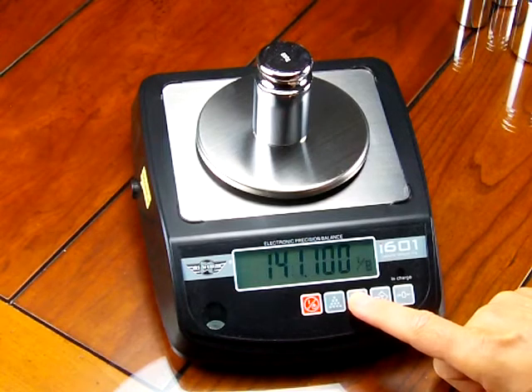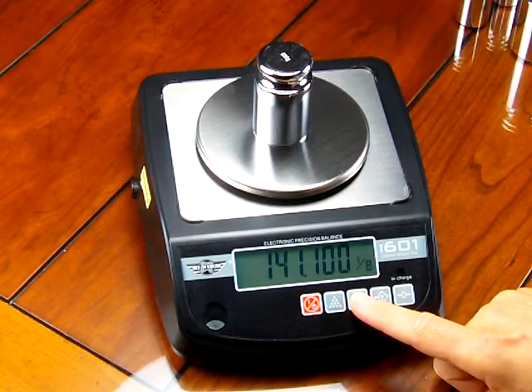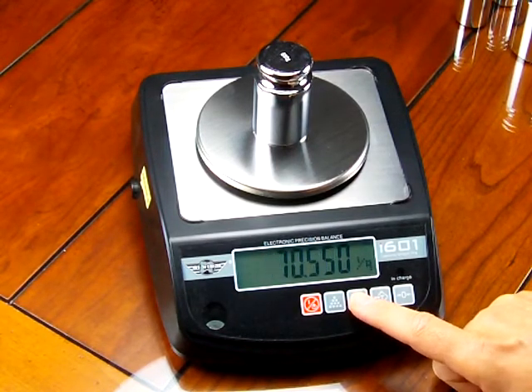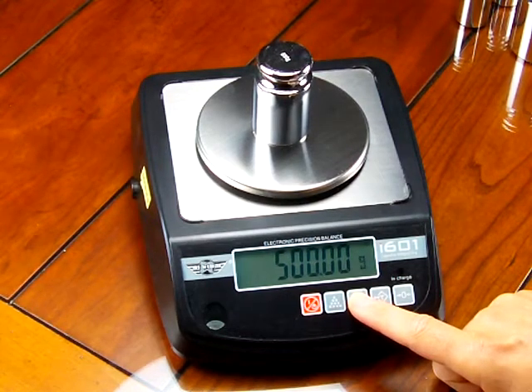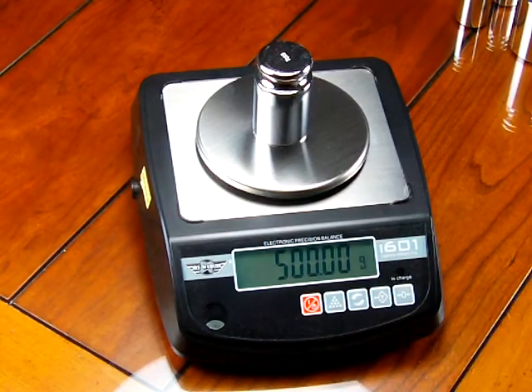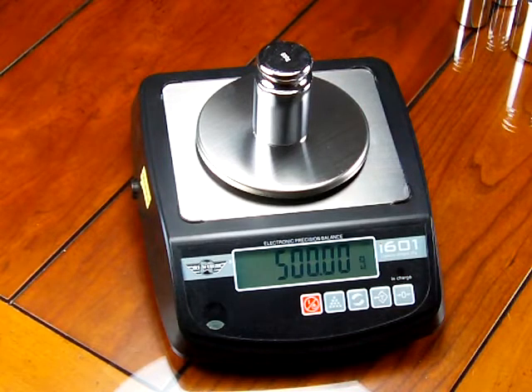Here is another tael. I don't know. It looks like right here it says one-eighth, one-quarter. And we are back to grams. So you can see they added a lot more weight modes with this LCD version.